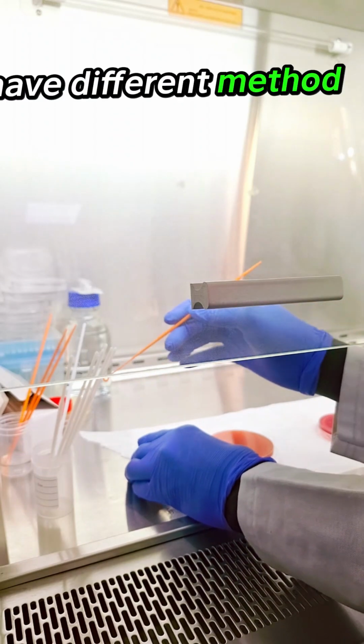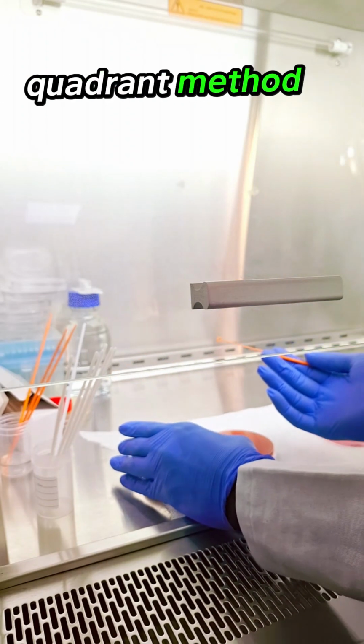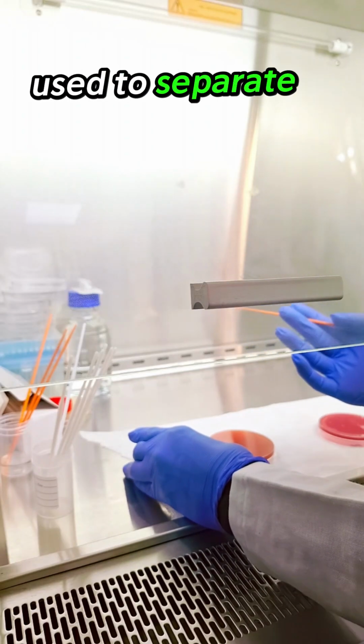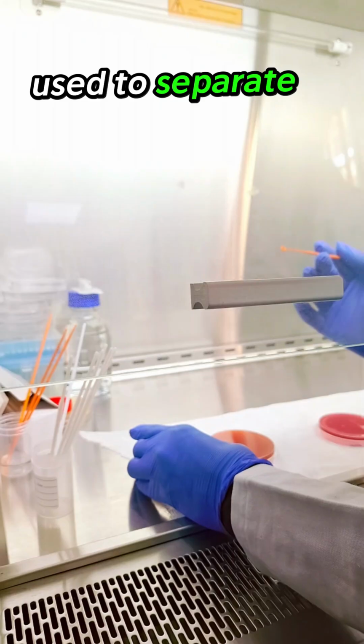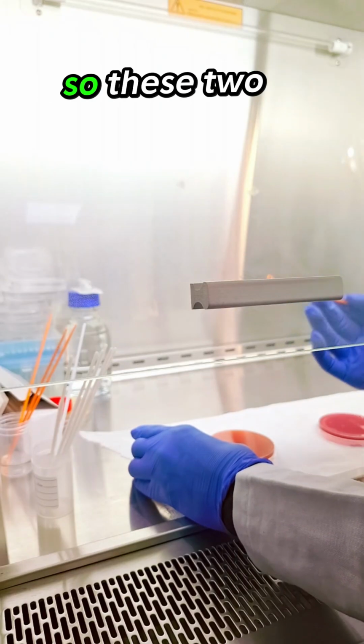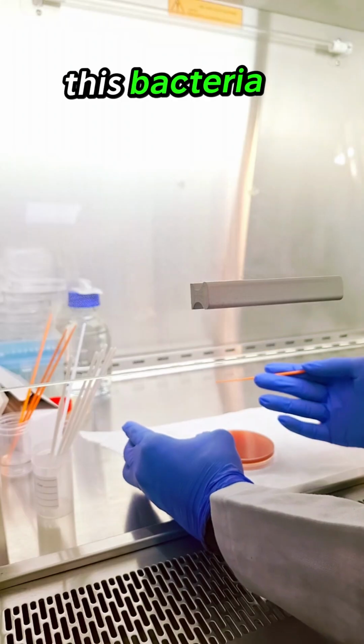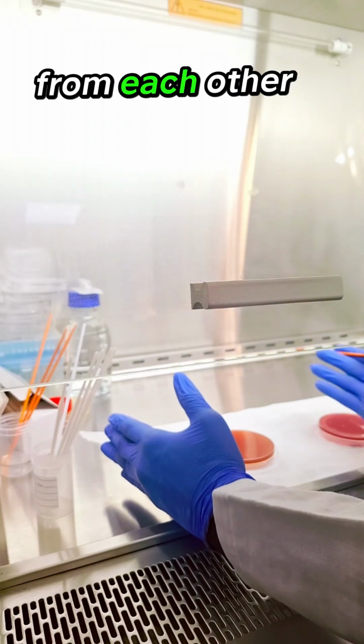Of course, you have different methods of streaking. We have the quadrant method. We have the T-streaking method. Those are the two ideal methods that can be used to separate these mixed cultures. These two methods are very good because they dilute these bacteria and separate them from each other by streaking.